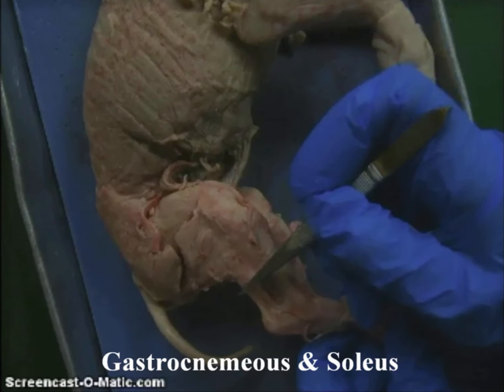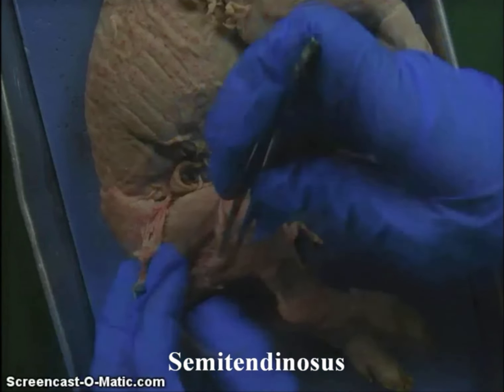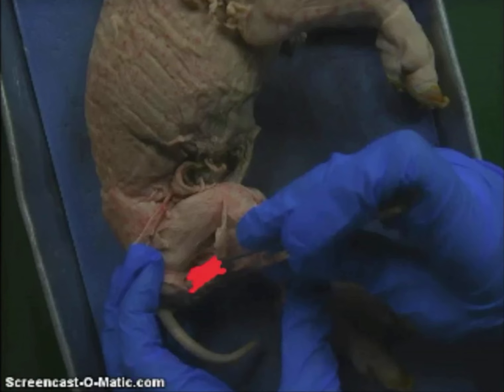The gastrocnemius and the soleus are hard to differentiate. The soleus is deep to the gastrocnemius, but it's hard to tell. The semitendinosus is if you cut through the biceps femoris, and remember that the semitendinosus is on the lateral view of the leg, and they both have T's in them. So there's the semitendinosus right there in the red.